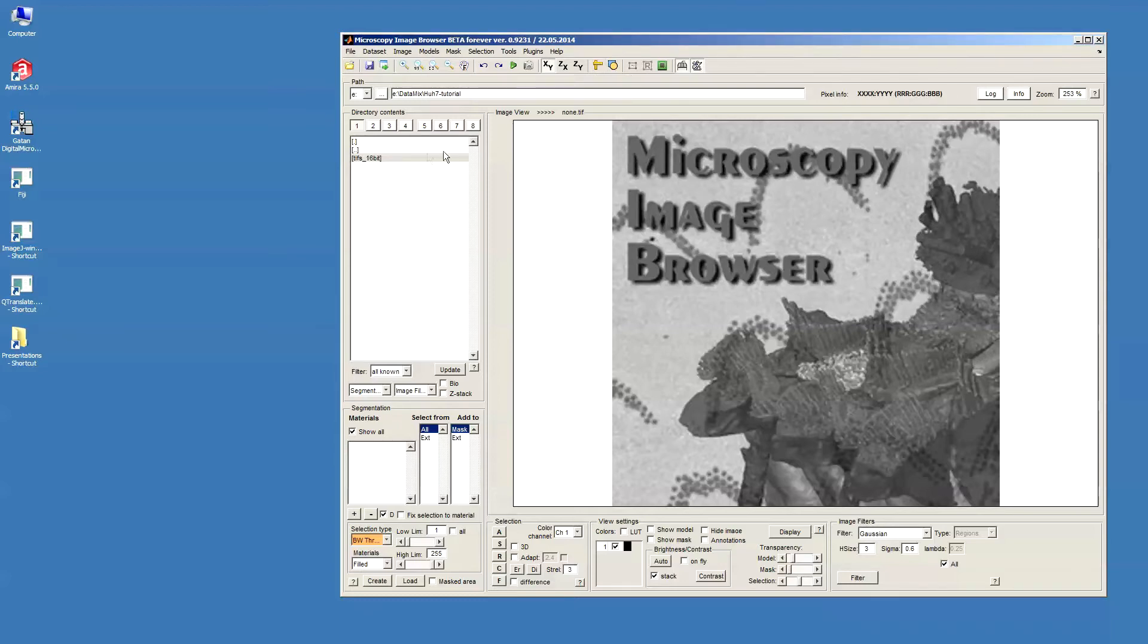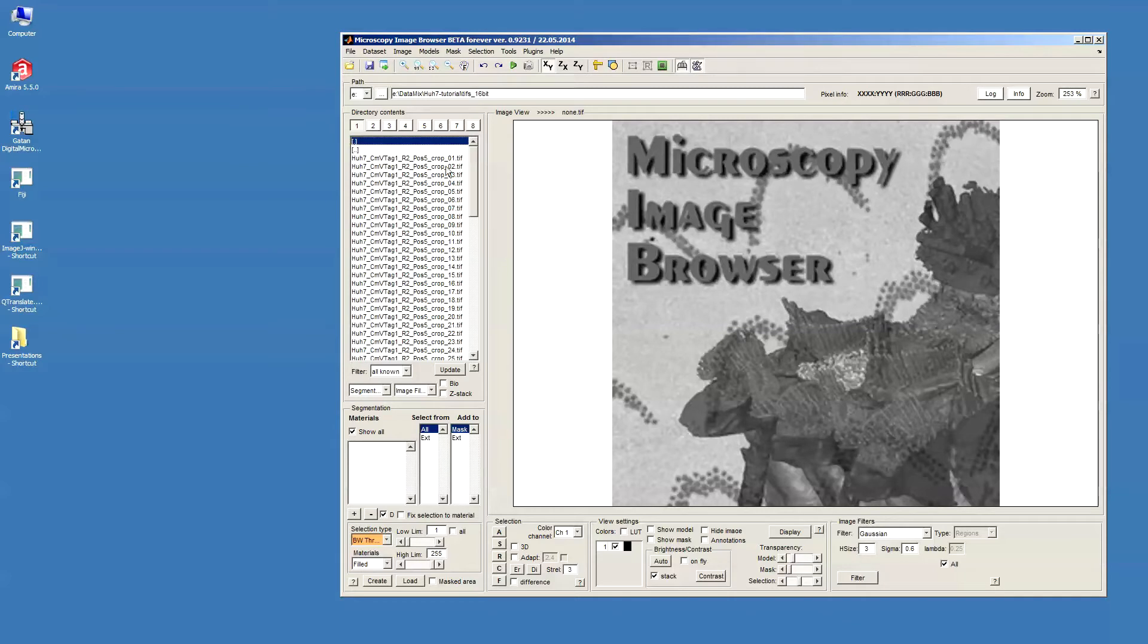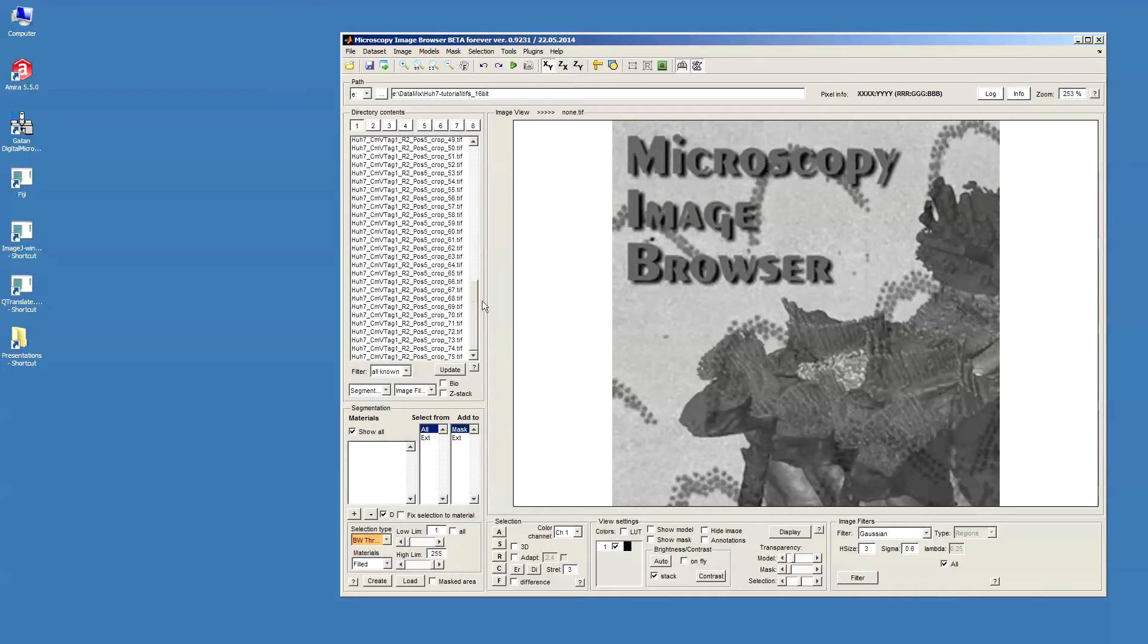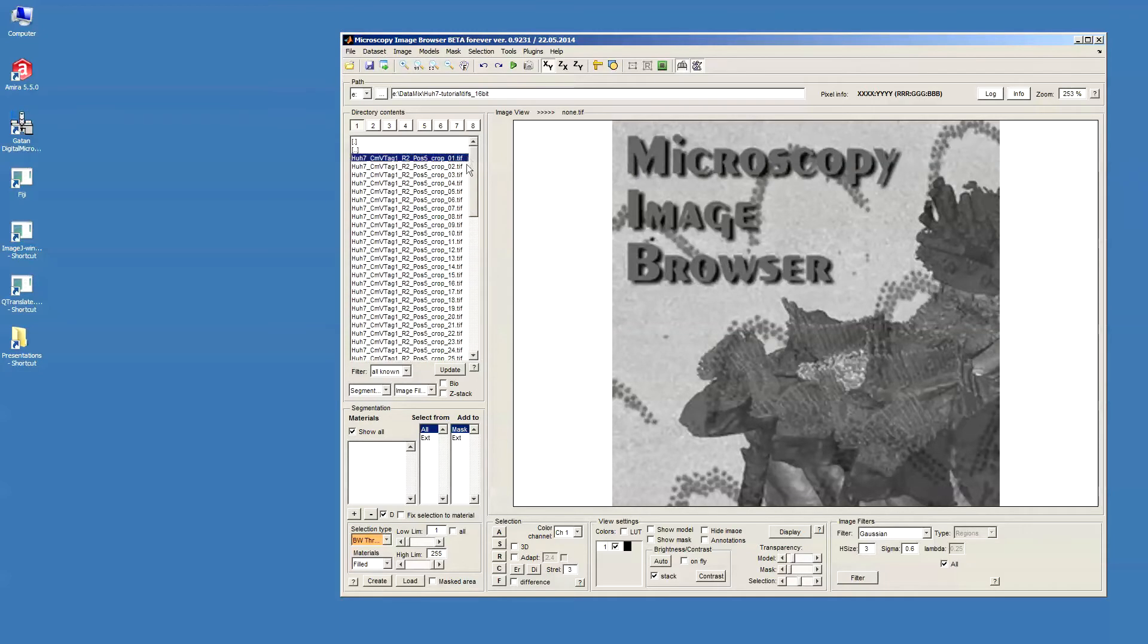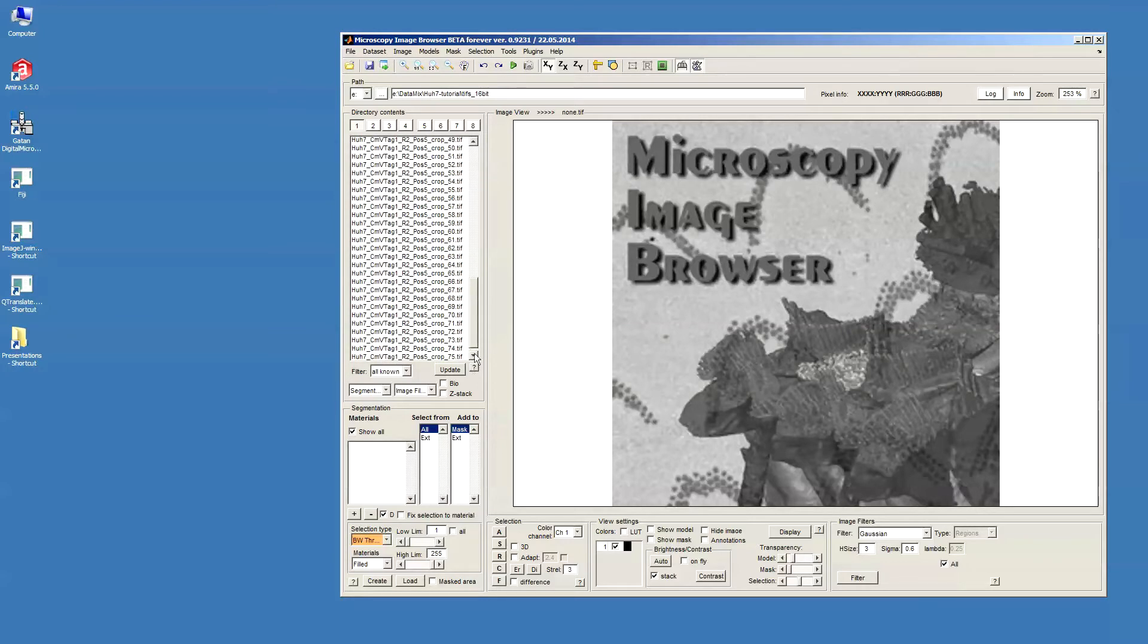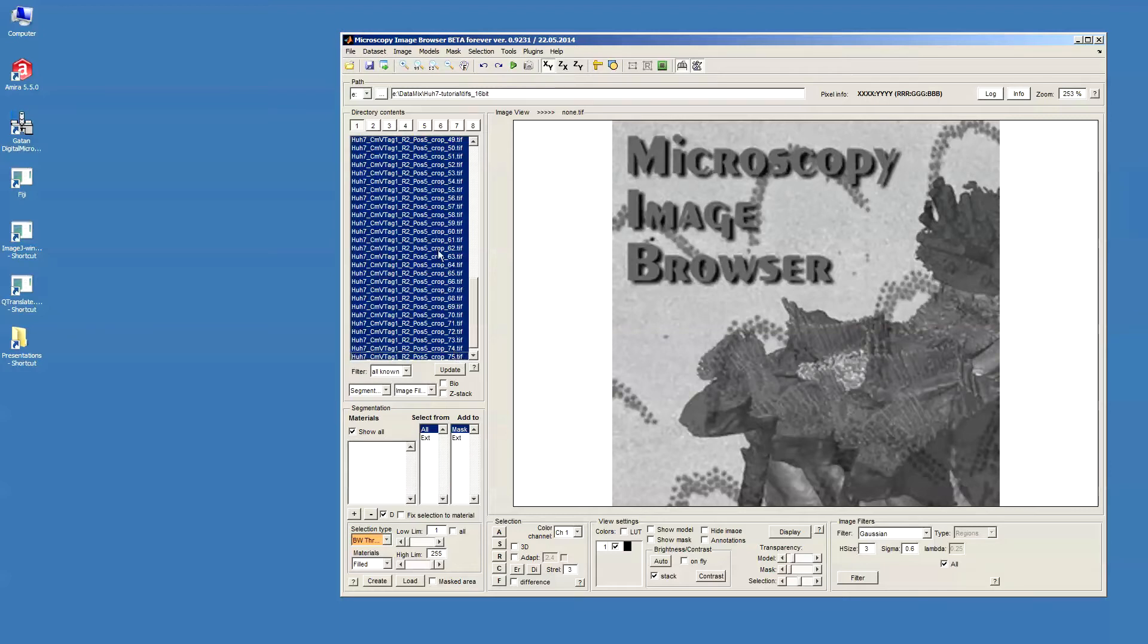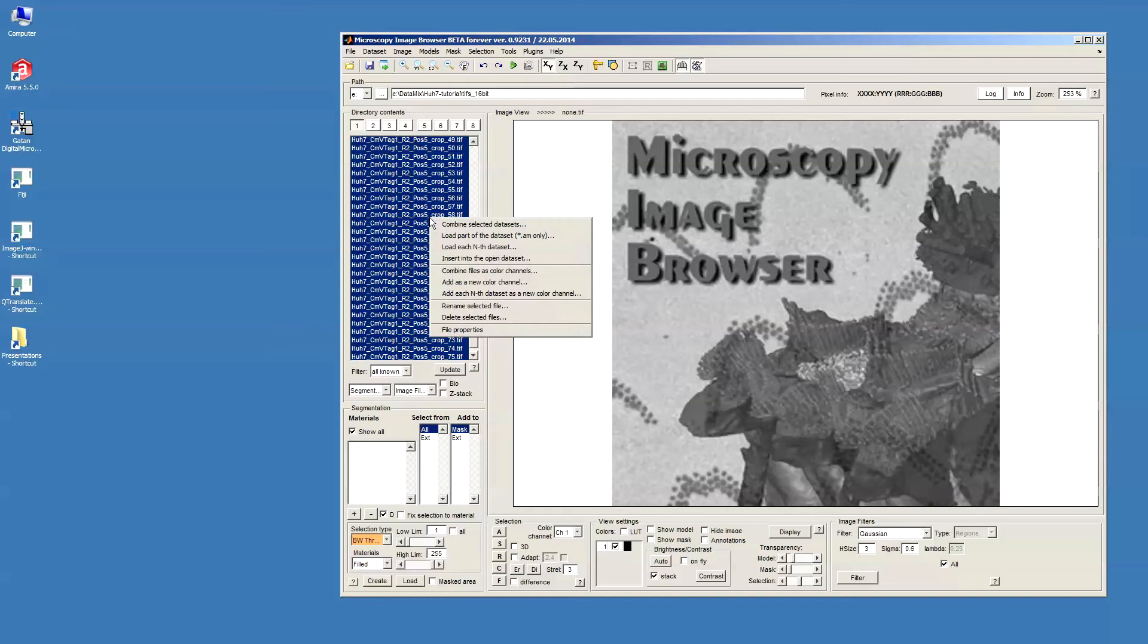First, we need to open the data. In this particular case, the data is stored as 16-bit TIFF files where each file has a single section. In order to assemble these files into a 3D stack, I should select these files by highlighting the first file using the left mouse button, then using shift click on the last file, and then press the right mouse button to call a pop-up menu.